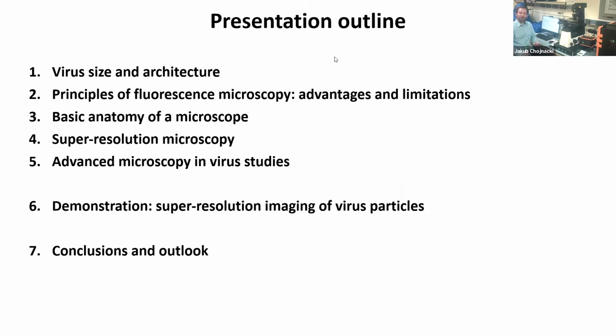Then we're going to talk a little bit about an introduction to so-called super resolution microscopy, of course, providing all the background on what resolution is and what this thing called super resolution is. And finally, I will touch upon how super resolution microscopy is very useful for studying virus particles.